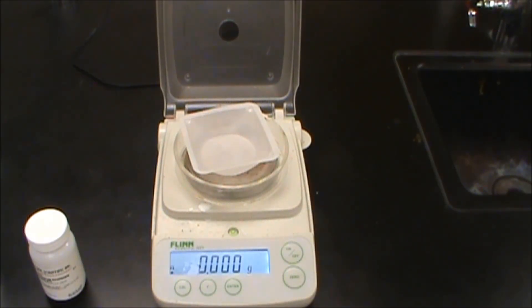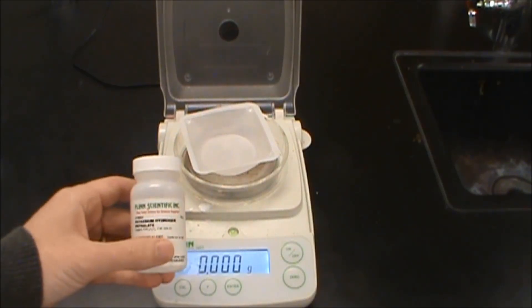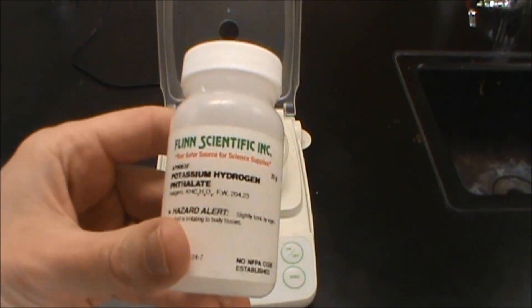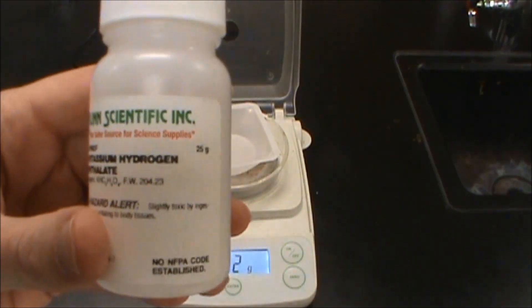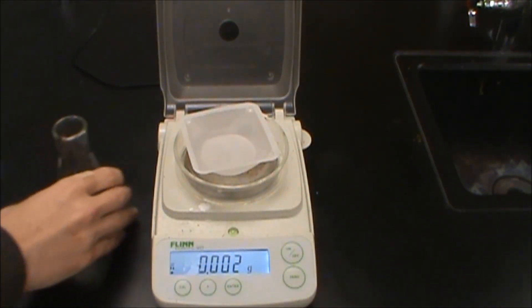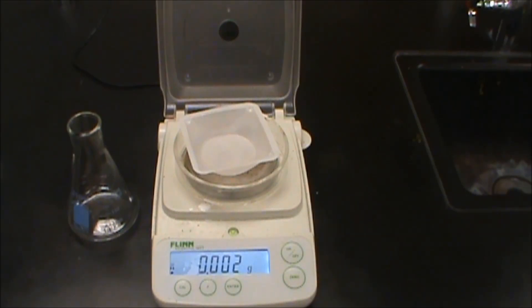Here we're going to do a standardization titration. We're going to use potassium hydrogen phthalate, which has a molar mass of 204.23 grams per mole. And what we're going to do is really simply we're going to put that in some distilled water to figure out the concentration of a sodium hydroxide solution using titration.